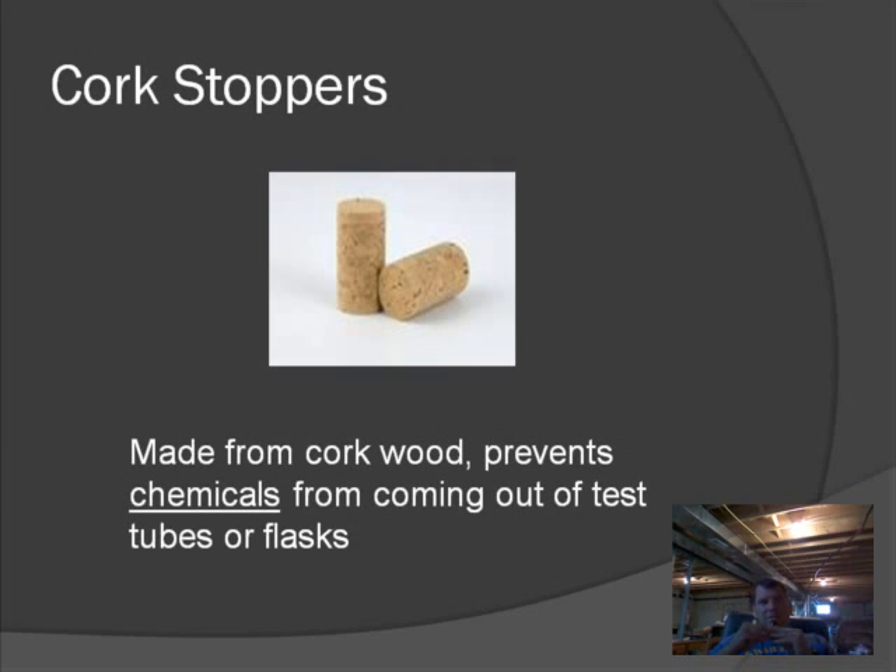Here's another type of stopper — this is called a cork stopper. You may wonder why we have two kinds of stoppers. Some chemicals react with rubber, so you'll want to use cork instead; and of course some chemicals react with cork. Cork stoppers work the same way as rubber stoppers — they can stop up the Erlenmeyer flask, Florence flask, or a test tube, depending on the size of the cork.